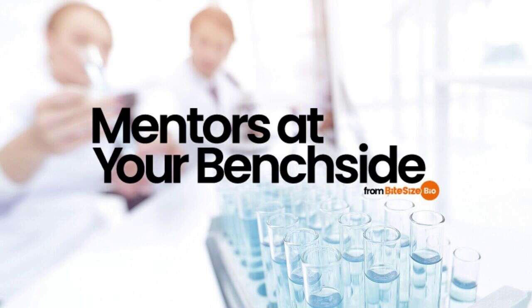As a rule, aim for a minimum of 60 degrees and a maximum of 63 degrees C. The ideal primer melting temperature is 60 degrees C, with a maximum difference of 3 degrees C in the melting temperature of the two primers. Melting temperature calculators, like the one we have included in the episode description, can be used to determine these temperatures.